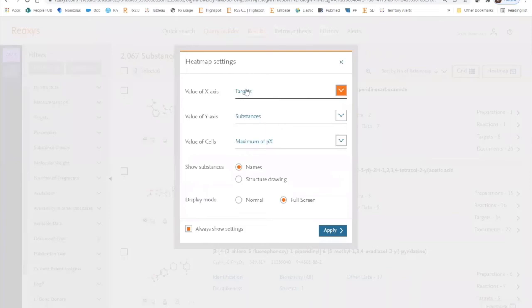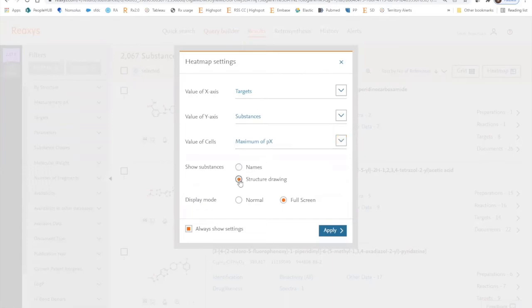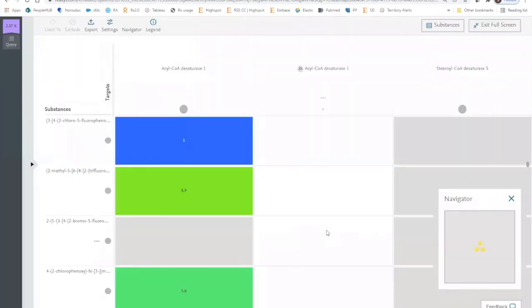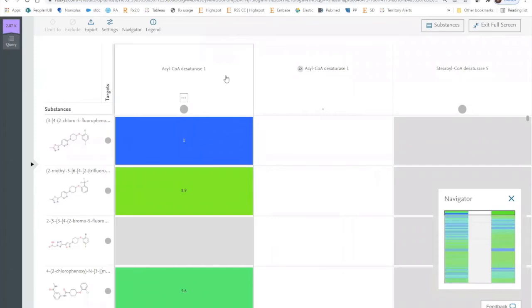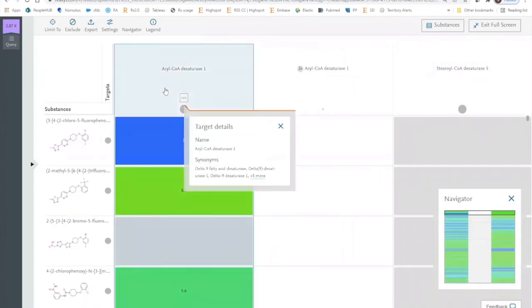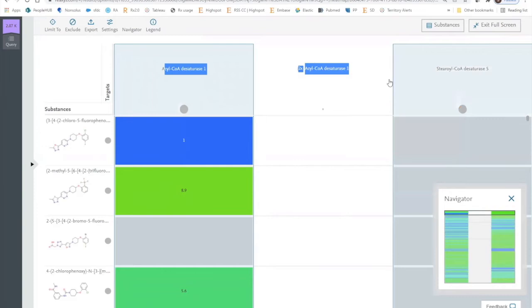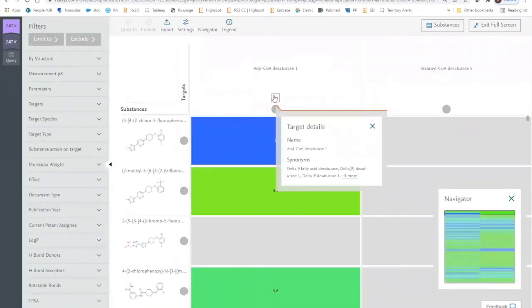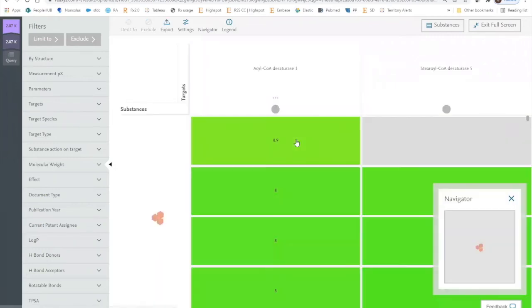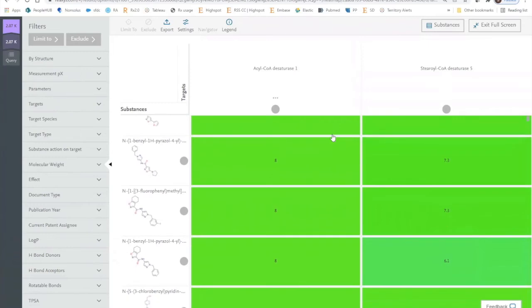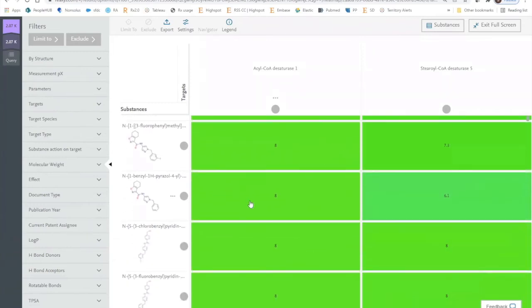The heat map allows us to graph targets on the x-axis and substances on the y-axis. The value of each cell will be determined by the level of potency against those specific targets. We'll include the structure drawn in the heat map. We can now select SCD1 and SCD5 as the specific targets, which we want to limit the heat map to. We can sort by activity.